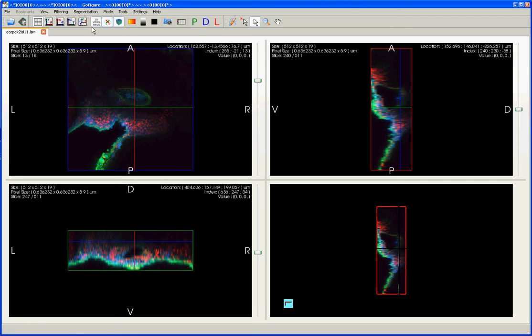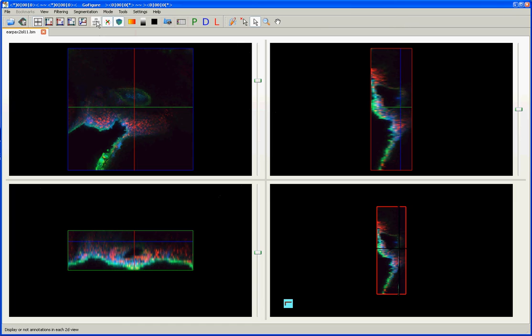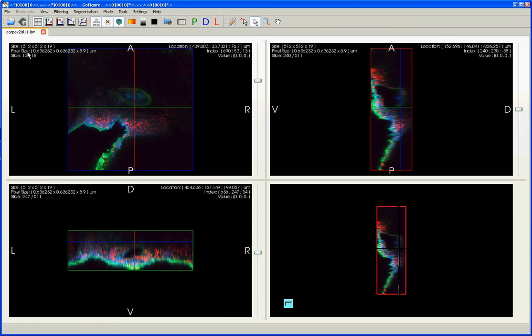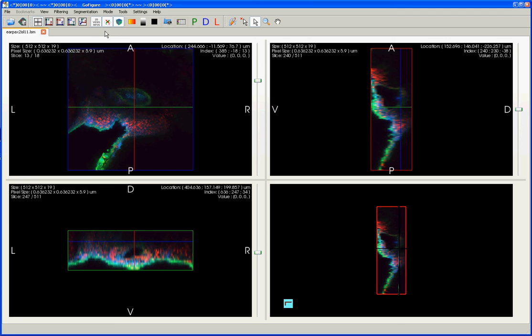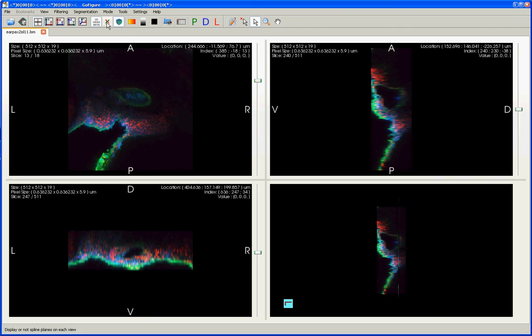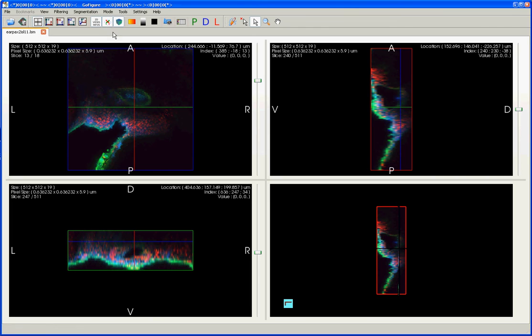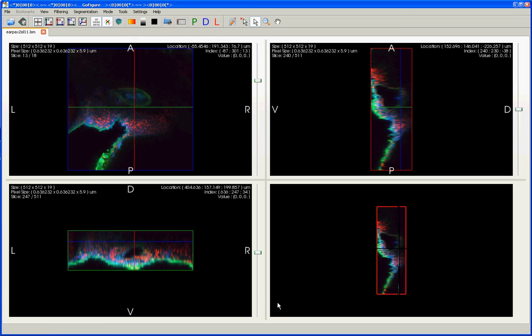You can use these three toggle buttons up here to change what information is being displayed on your screen at any given time. This first toggle button will add or remove the white text from each of the views. The second toggle button will add or remove these red, green, and blue highlighting for each of the axes in the images. And this third button will add and remove this 3D cube that is useful for orienting you in the 3D view.